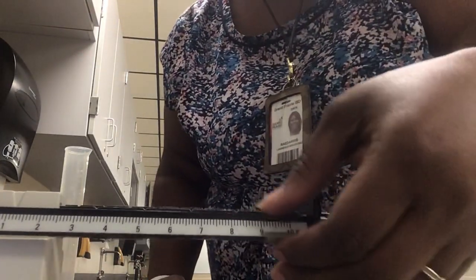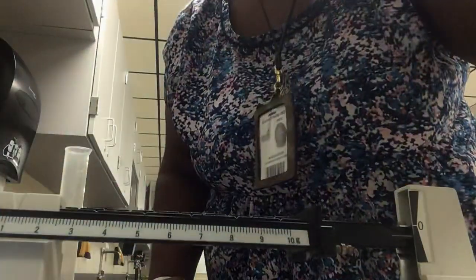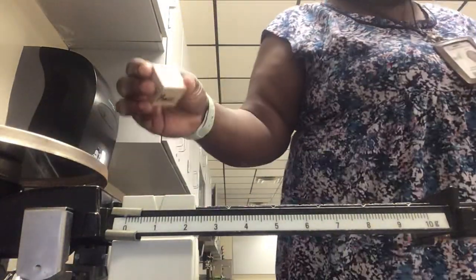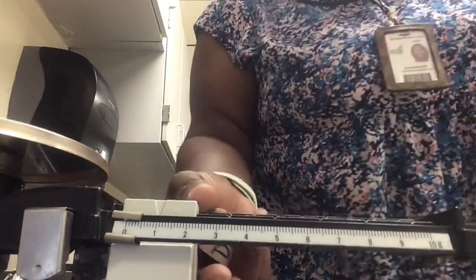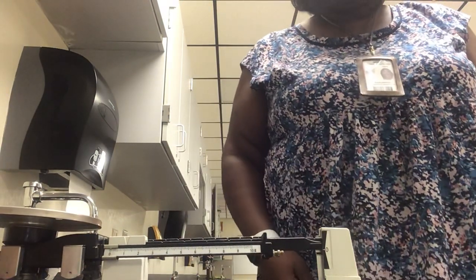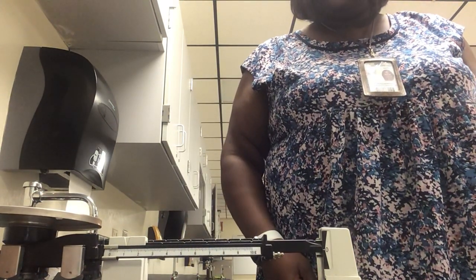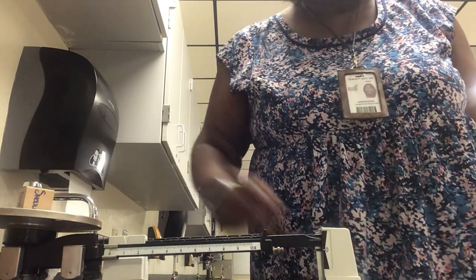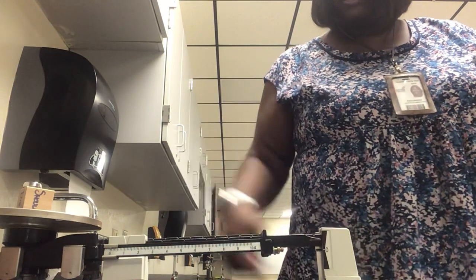Not our graduated cylinder, I'm sorry. Our triple beam balance. Because we're no longer using the graduated cylinder anymore, for the simple fact we don't have an irregular shape item. All right? So again, we always zero out the scale. And remember, zeroing out the scale simply means making sure it's on 0 before we actually put an item on there. All right? So I'm going to place my cube on the scale just like I did my irregular shape item.